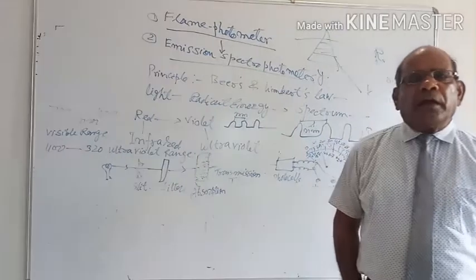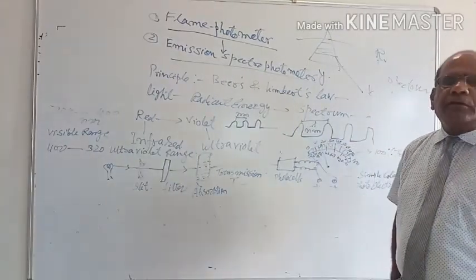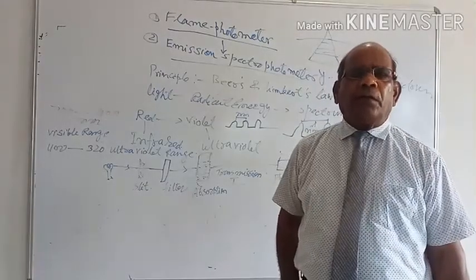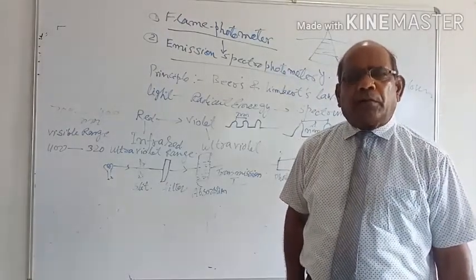Now, today, another technology of spectroscopy is emission of spectrum.